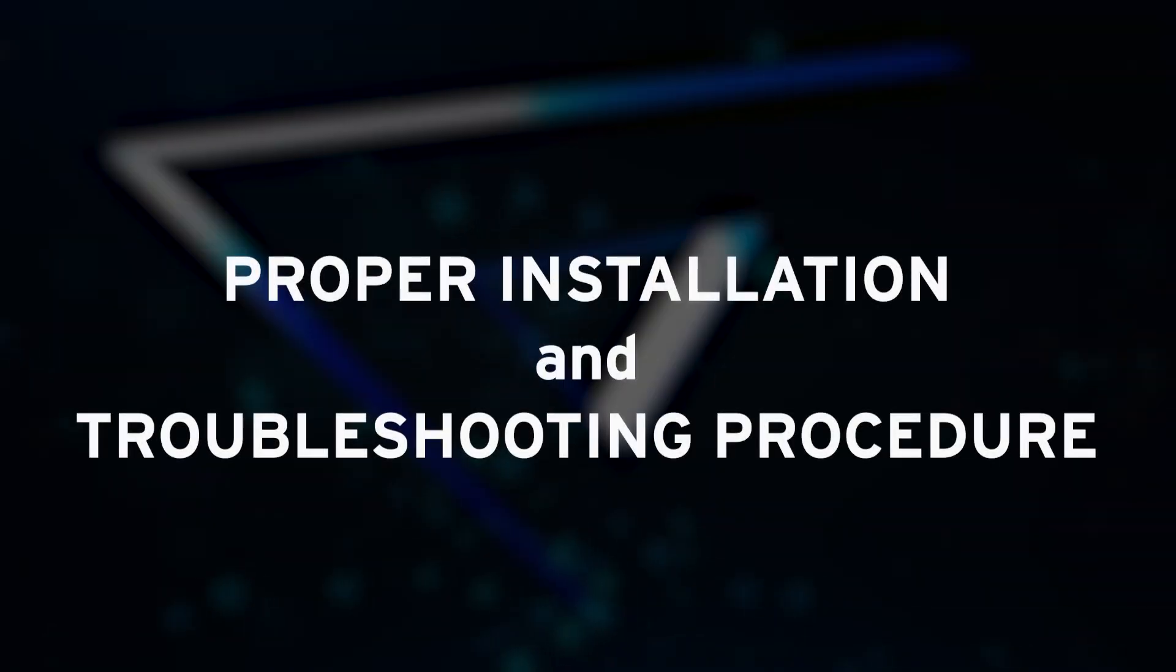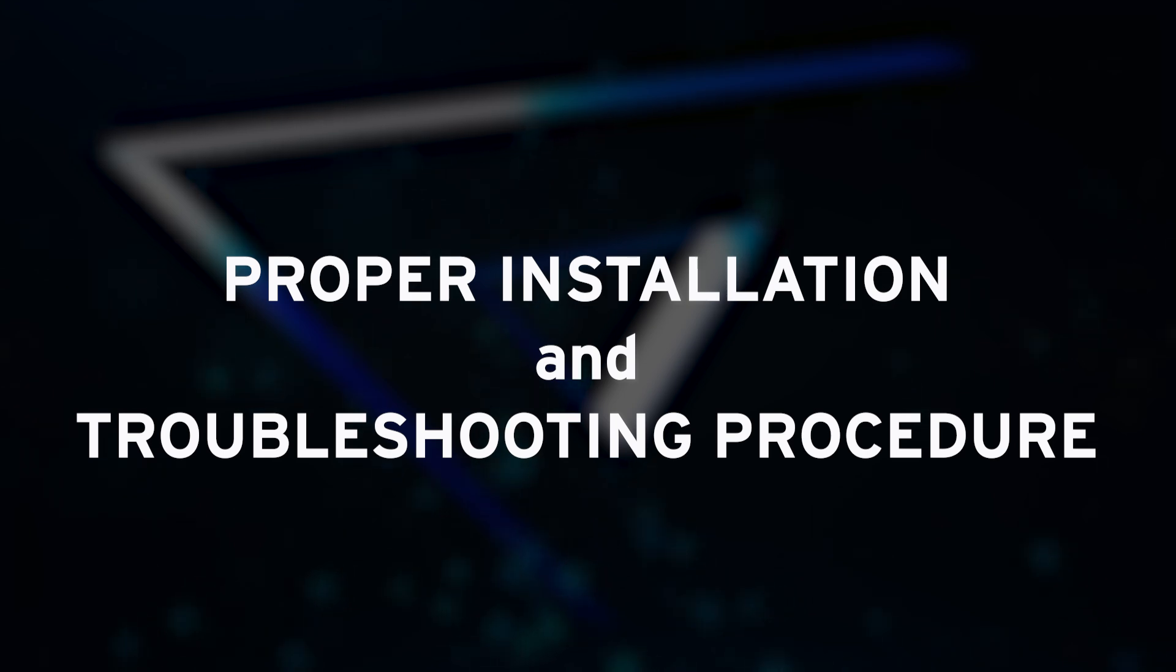Hello, I'm Phillip Preston, President of PolyScience. We want to cover proper installation of the chiller and troubleshooting procedure.